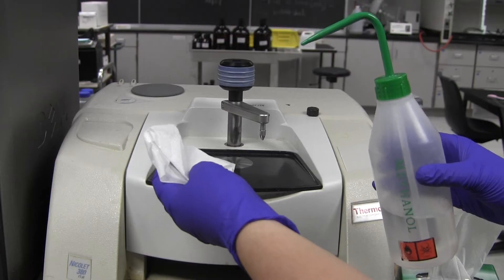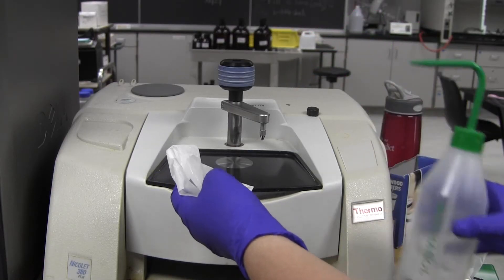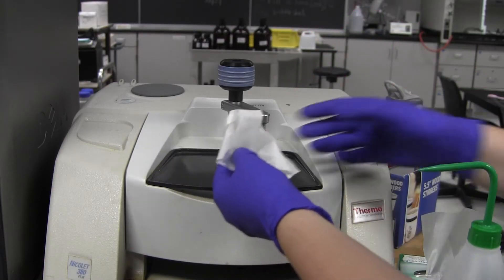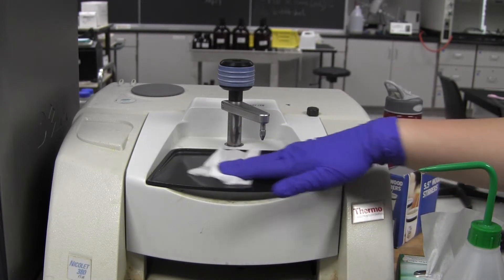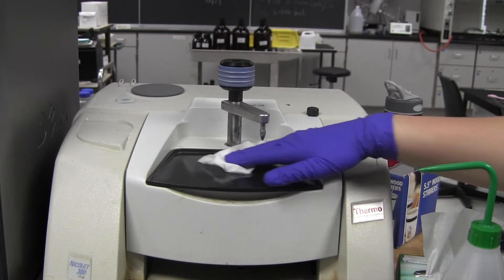First, make sure that the sample plate and crystal lens are clean. If not, squirt some methanol on a tissue and wipe the area clean.